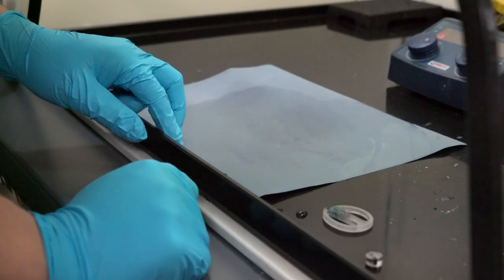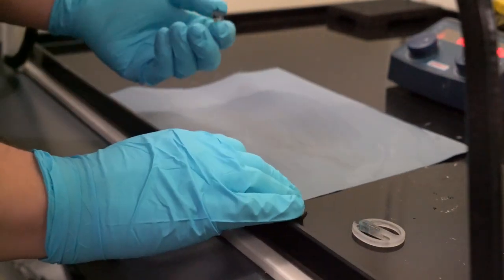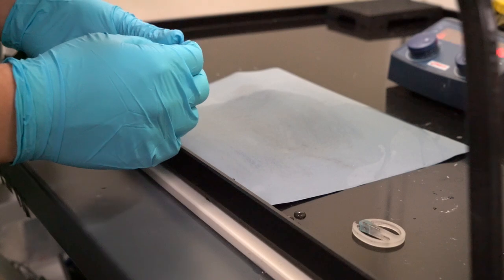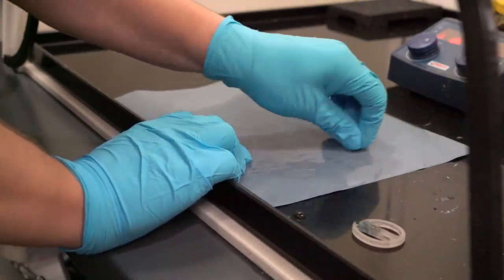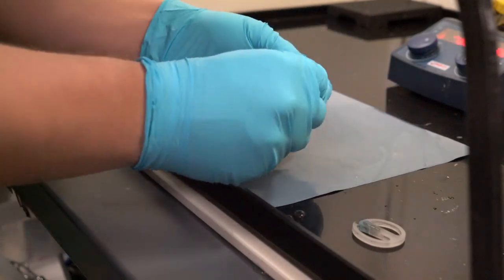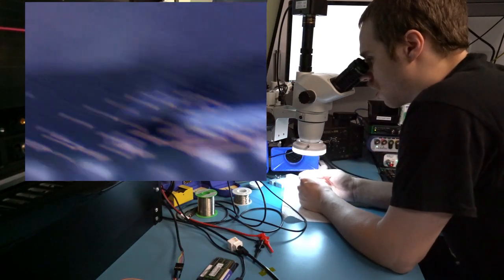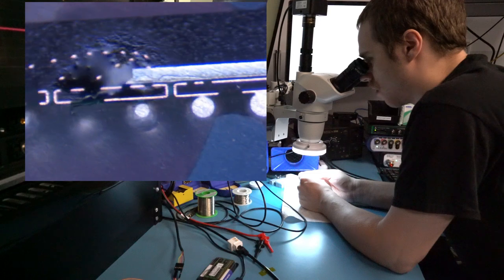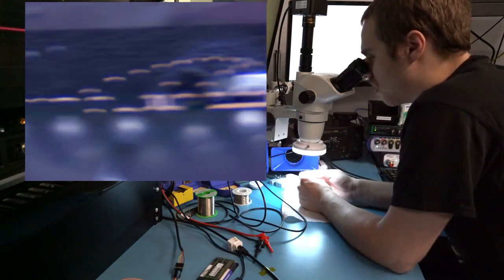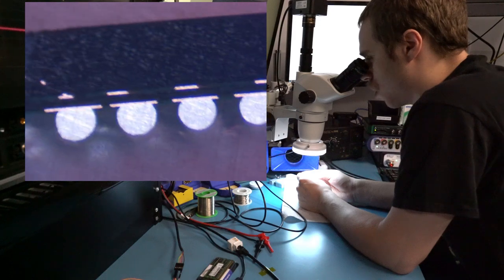For these finer passes you really don't need a lot of time. The earlier ones took probably 10 minutes of sanding at each grit for the 500 and 1200 — maybe even more than that. But now that we're doing just surface finishing, the amount of material we're taking off is so small it just takes a few seconds. After close to a minute polishing the BGA sample we can see it looks a lot nicer — all of our scratches are now horizontal, there's nothing really vertical left, and we've got a much nicer texture on the solder balls. This is probably about as far as we can go on the stereo microscope — we're going to switch to the metallurgical for inspection from here on out, since we can't really see the scratches anymore at 45x magnification.